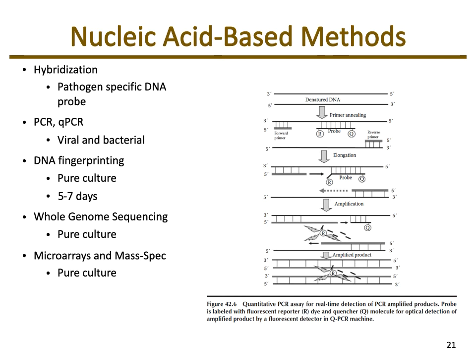If it's a mixed culture, if there's a contaminant in it, it's going to skew your data. You've taken all this time to get what you think is a pure culture, but there's a contaminant in it, and then your data is useless. So those are huge downsides with techniques where you need a pure culture.